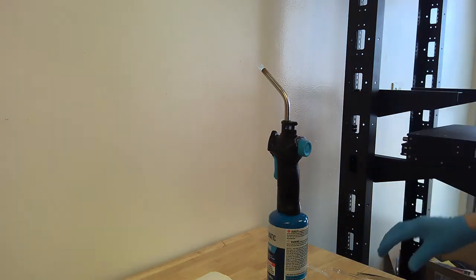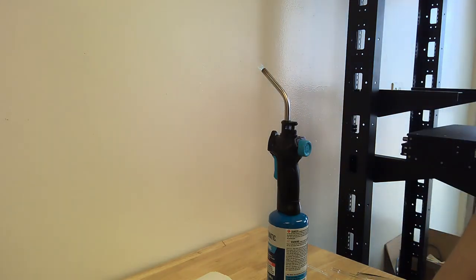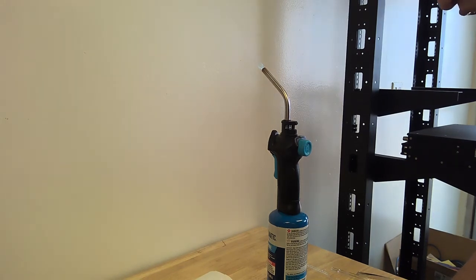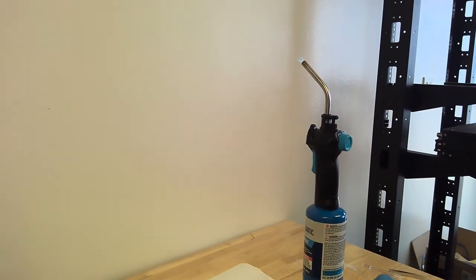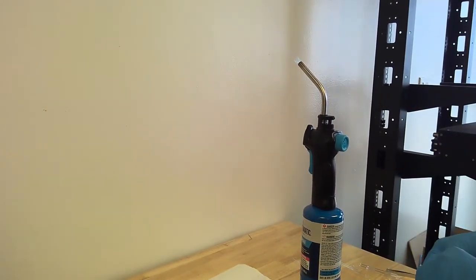So, using our designated glassware scorer, I'm going to score and break off a very, very small piece. And I'm going to aim for the middle as it has the thinnest piece of glass. So we're going to break off a tiny portion. You want the capillary bells to be simultaneously not too large that they don't fit, but not too small that the capillary bell is ejected when your substance begins to boil.